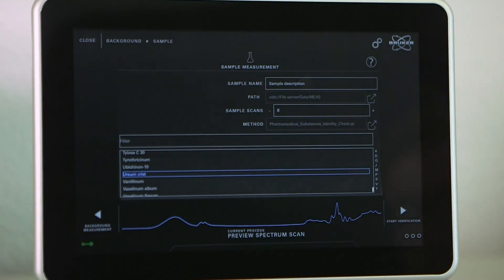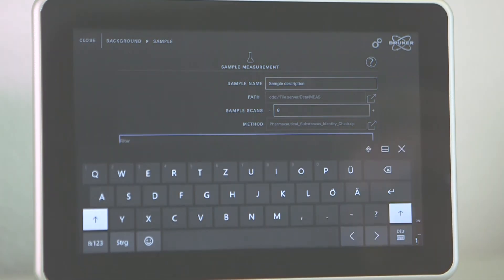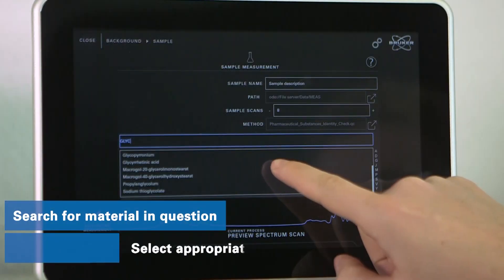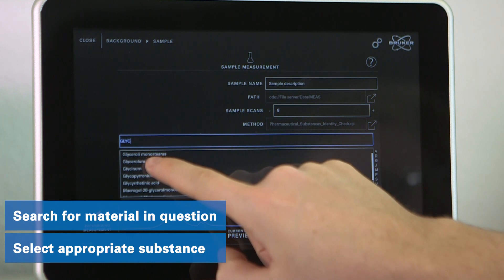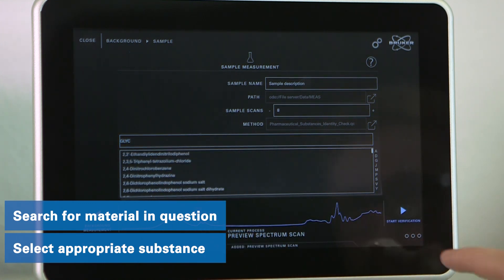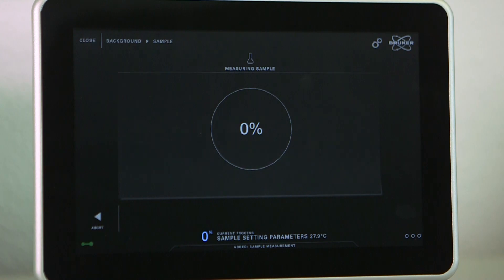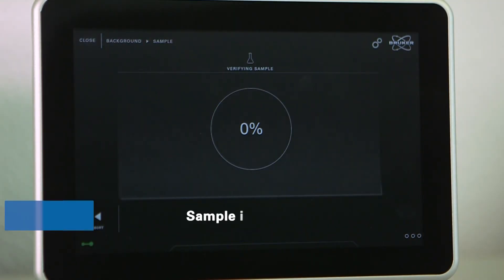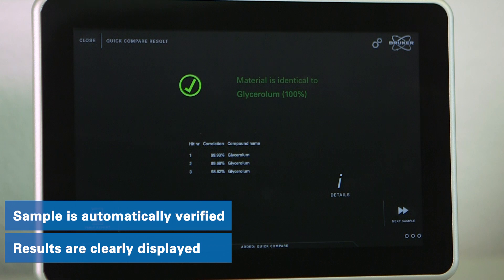Search the list of reference compounds for the material you want to verify and select the according compound from the drop-down menu. After the substance is selected, you can start your verification. The measured sample spectrum will automatically be compared with all reference compounds in the evaluation method.